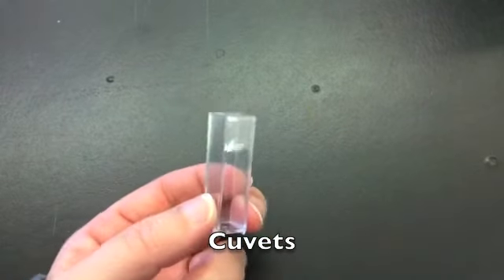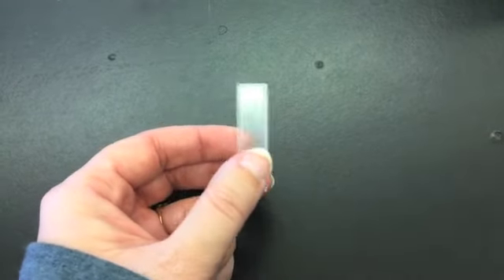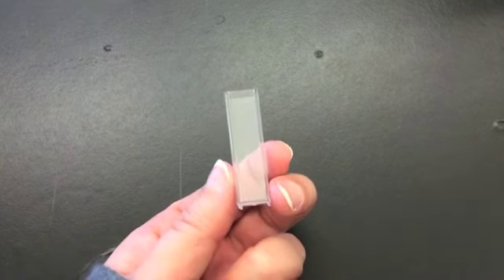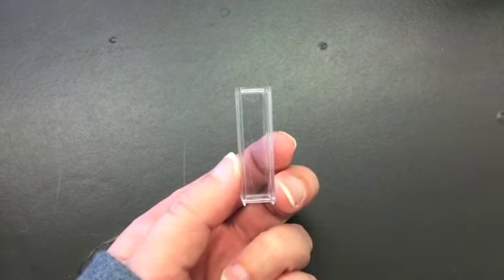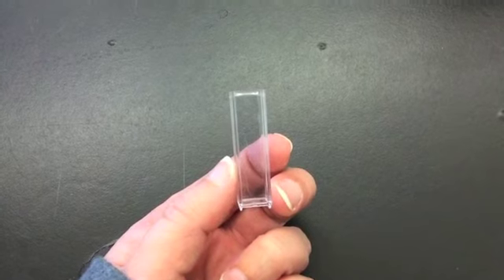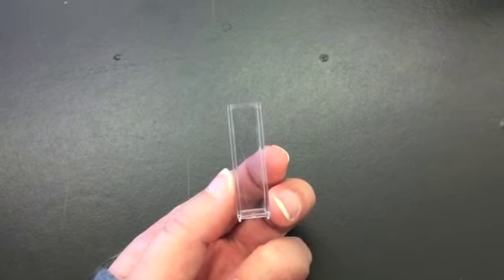These cuvettes are a little different than the cuvettes we've used in other labs. You'll notice first they are square. There is a side that has ribbing on it and a side that is smooth. We want to avoid touching the smooth side because this is the side that light will pass through. Your lab manual refers to a reference mark. Sometimes you will see at the top of one of the edges a triangle. If not, just make sure that you face one of the clear sides towards the reference mark in the colorimeter.